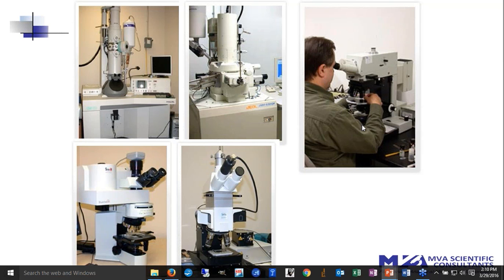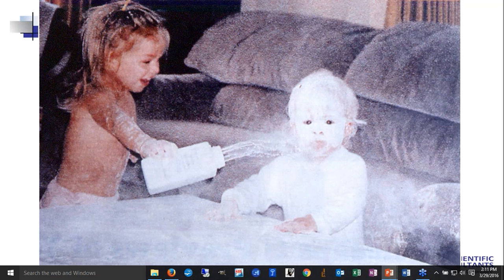The polarized light microscope is probably our most useful piece of equipment. Pound for pound, dollar for dollar, it's the least expensive type of microscope, but there's a trade-off in that the person using it, it's usually a minimum of 5 years experience to become proficient in it. So there is a steep learning curve on it.